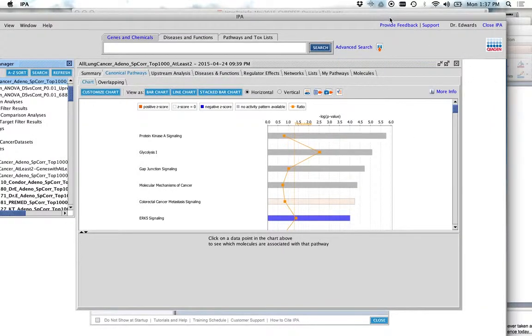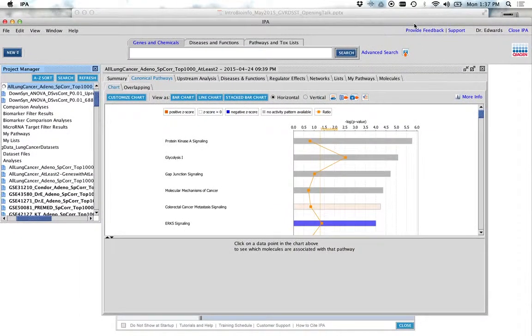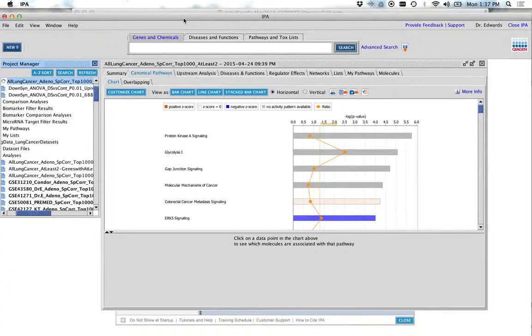Again, what we did was we sent instructions. We basically sent this gene list to somewhere in California. Their supercomputers, which are tied to all this scientific information that we know, are basically using that database and analyzing your data set with that. And then when it's finally done, it'll export that data onto this screen and you'll be able to see it. Okay. Let me stop there.